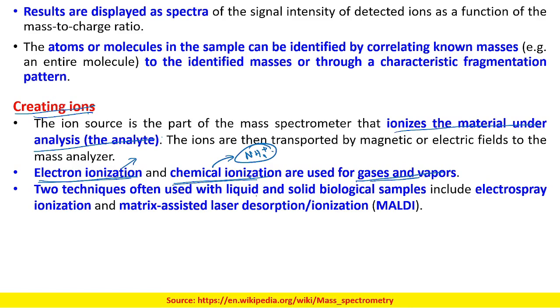Two techniques often used with liquid and solid biological samples are electrospray ionization and matrix assisted laser desorption ionization. In short, it is called MALDI.